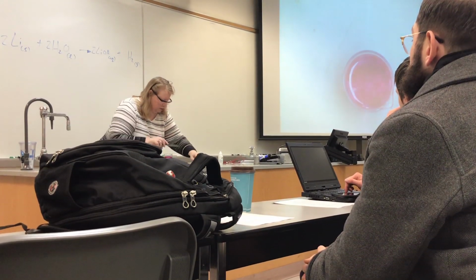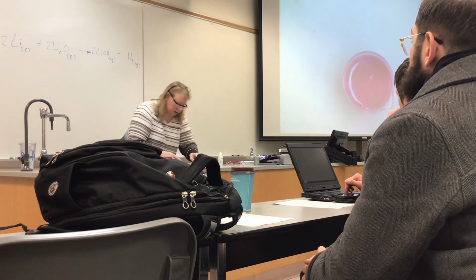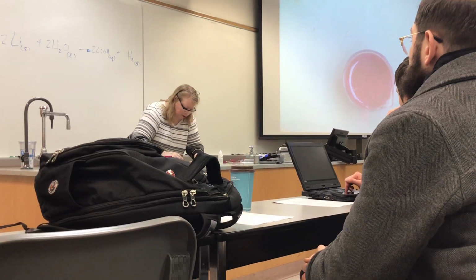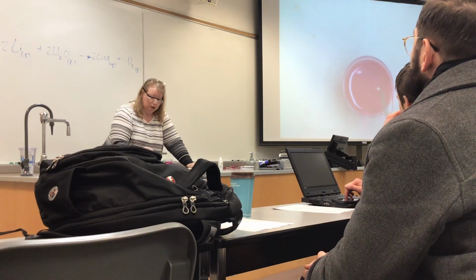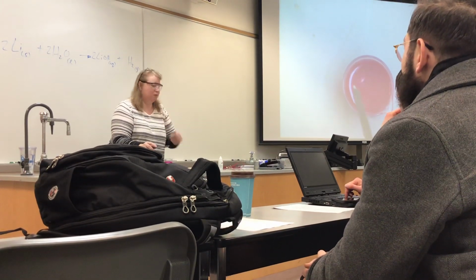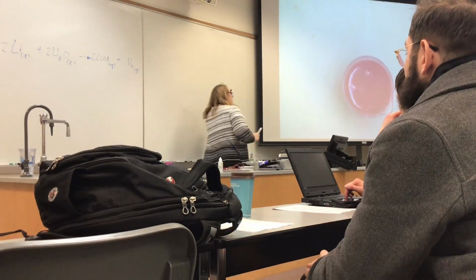Uh-oh, got on my finger, I don't want that. One more piece in. Oh, this might be too big. I'm always careful on this one because I think I told you last time I had a mishap on this one before, where I put too big of a piece in. I had a little mini explosion. Actually, it was a pretty big explosion. It went all the way to the document camera glass and I had to clean it up and it was a big mess.